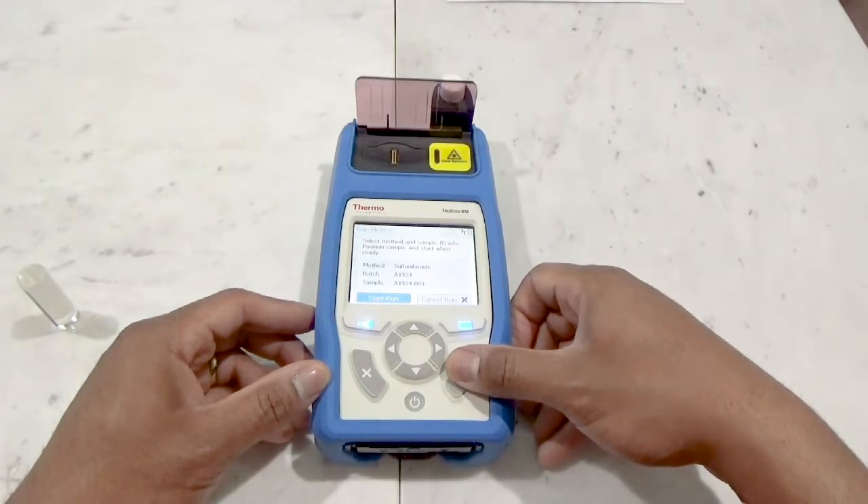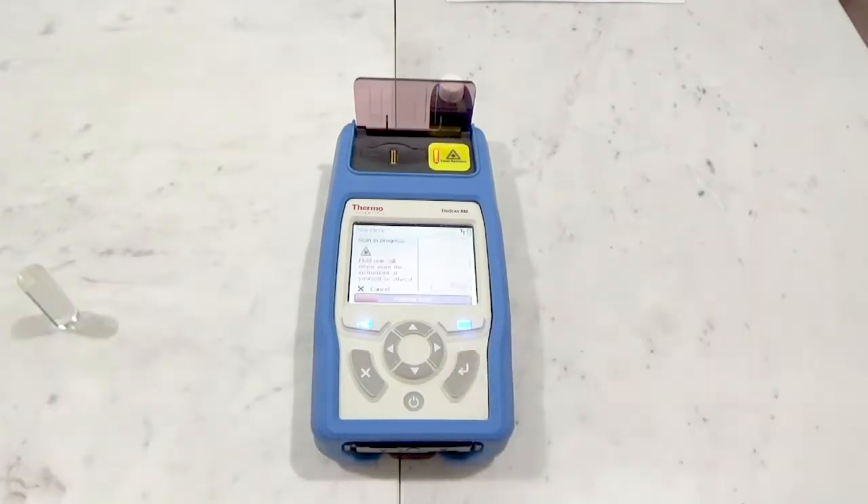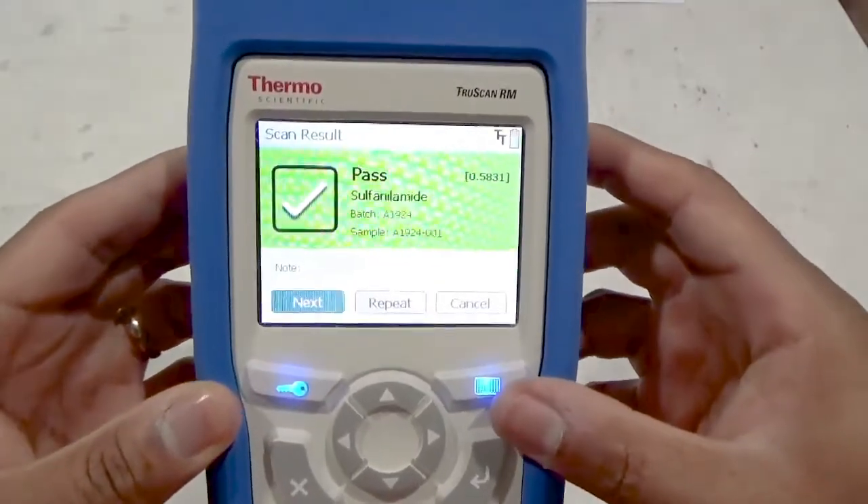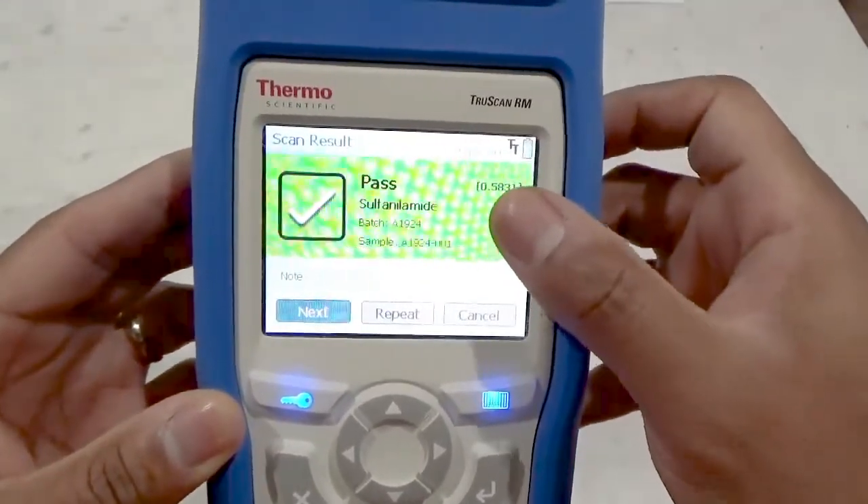Press the enter button to begin the sample analysis. Same as during the self-test, the yellow aperture laser warning will illuminate. The analysis status is noted at the bottom of the screen. Once complete, the result is calculated and shown. Here we see a passing result, and on-screen we see the resulting p-value that confirms our passing result with strong confidence.